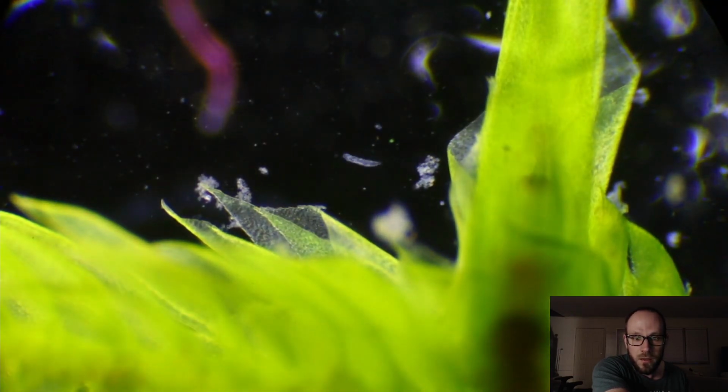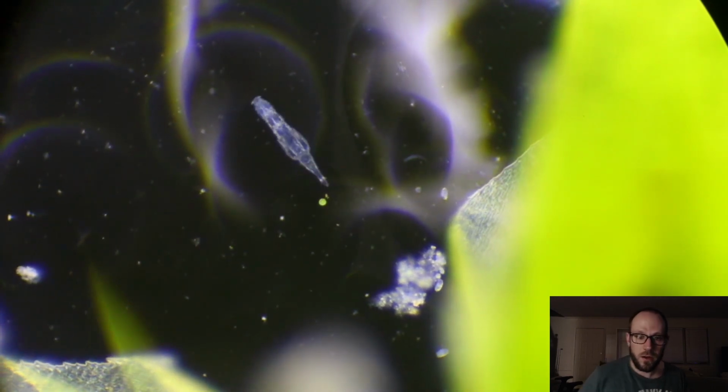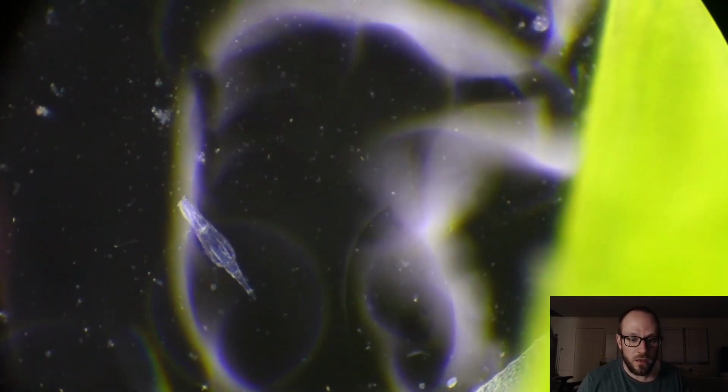I want to go to that one. Yeah, look at them. I don't know what that pink thing is, but screw it. It's not a rotifer. All of this in the search of tardigrades, which I have not yet found. So we are at 100x now. And there he is, unaware of our existence, as we look at that tiny cell.